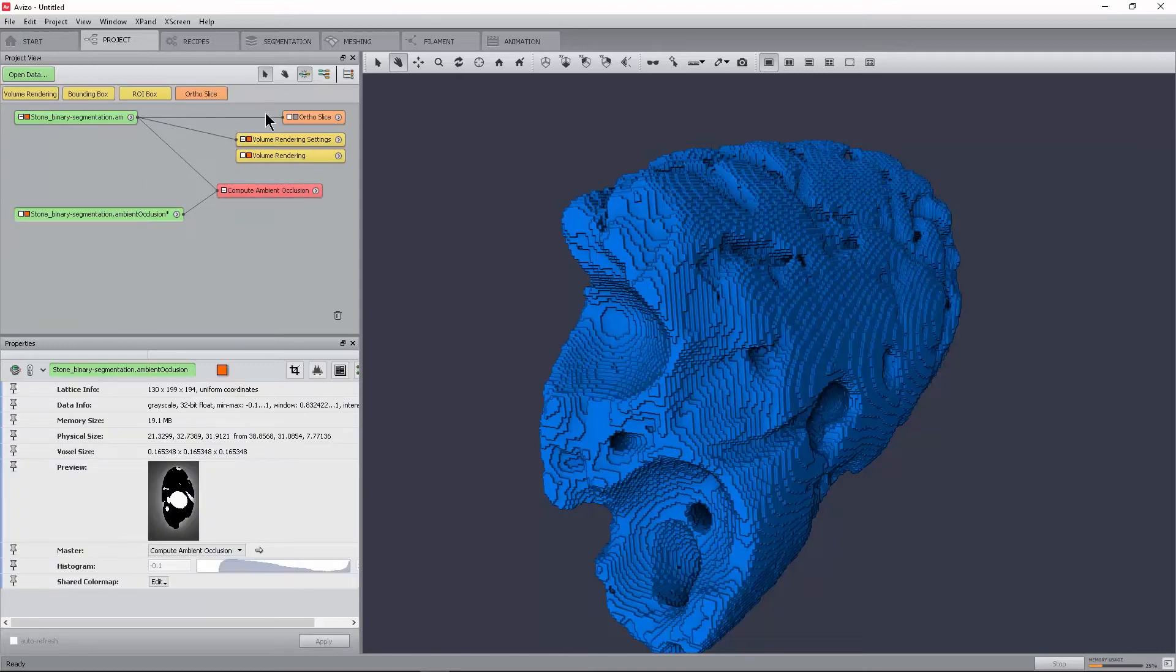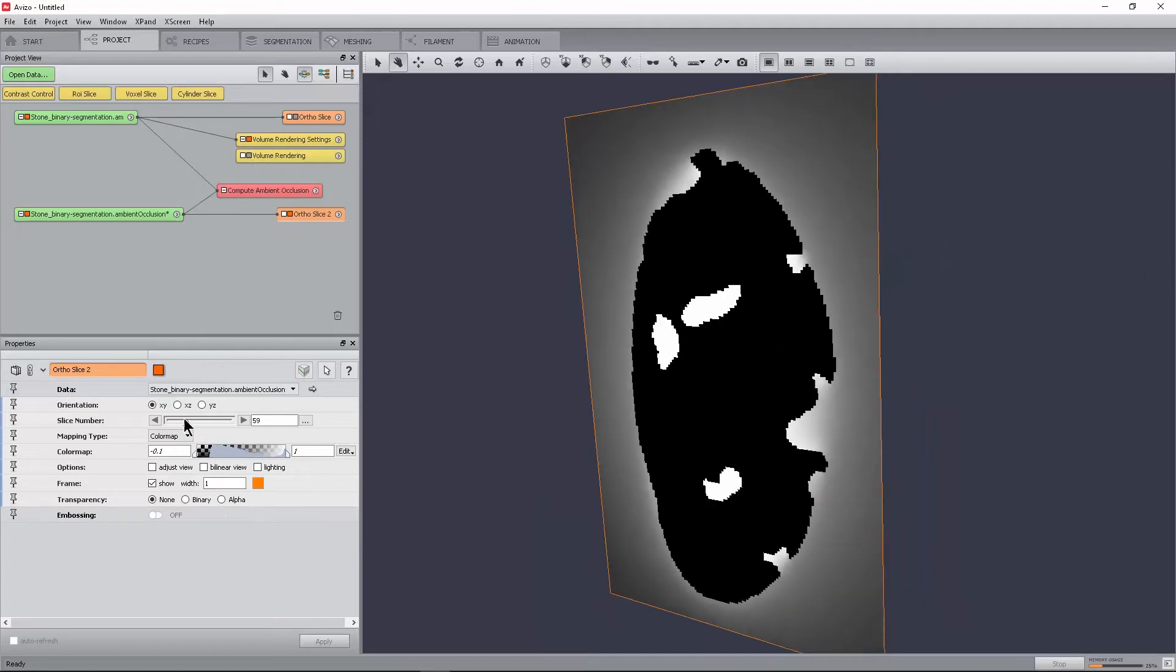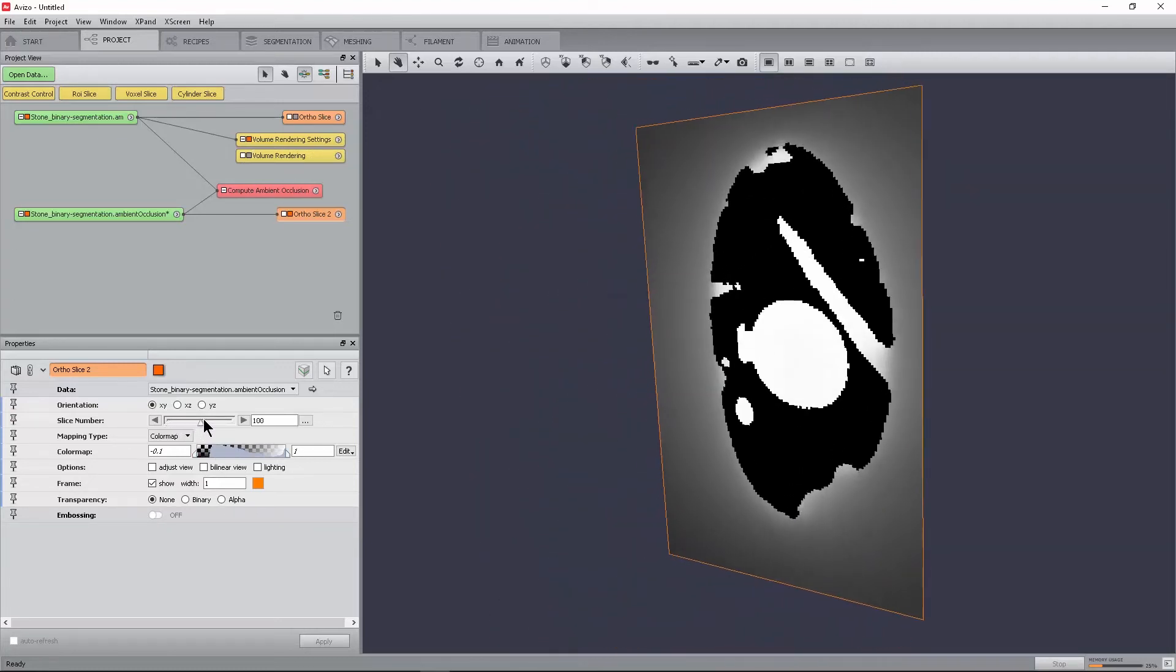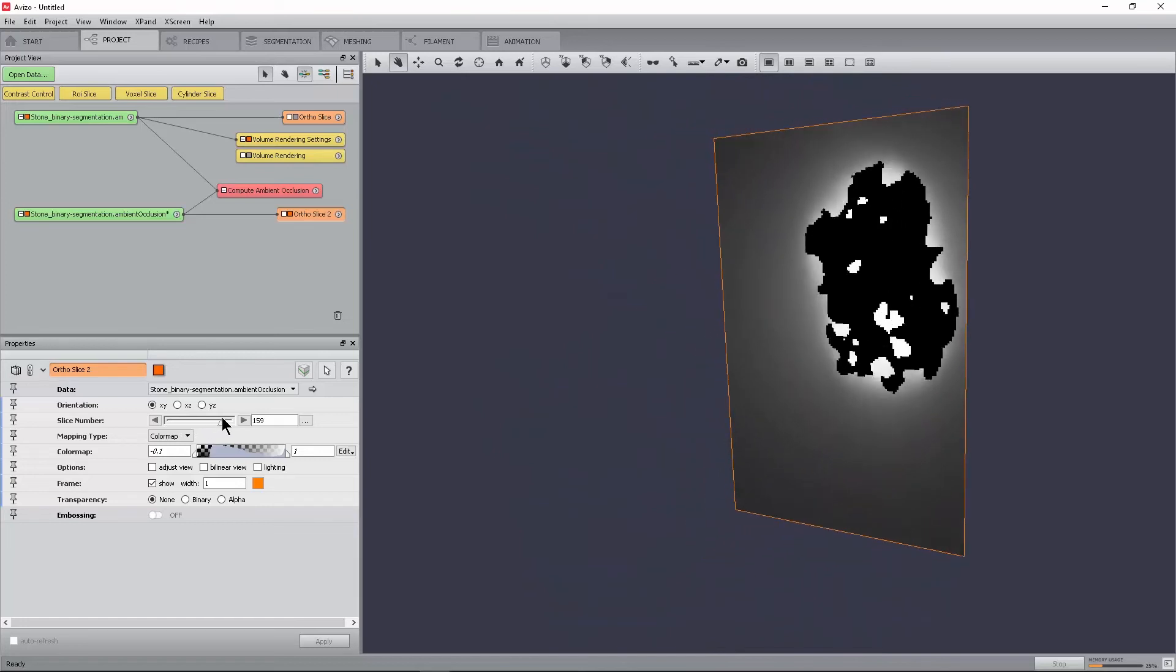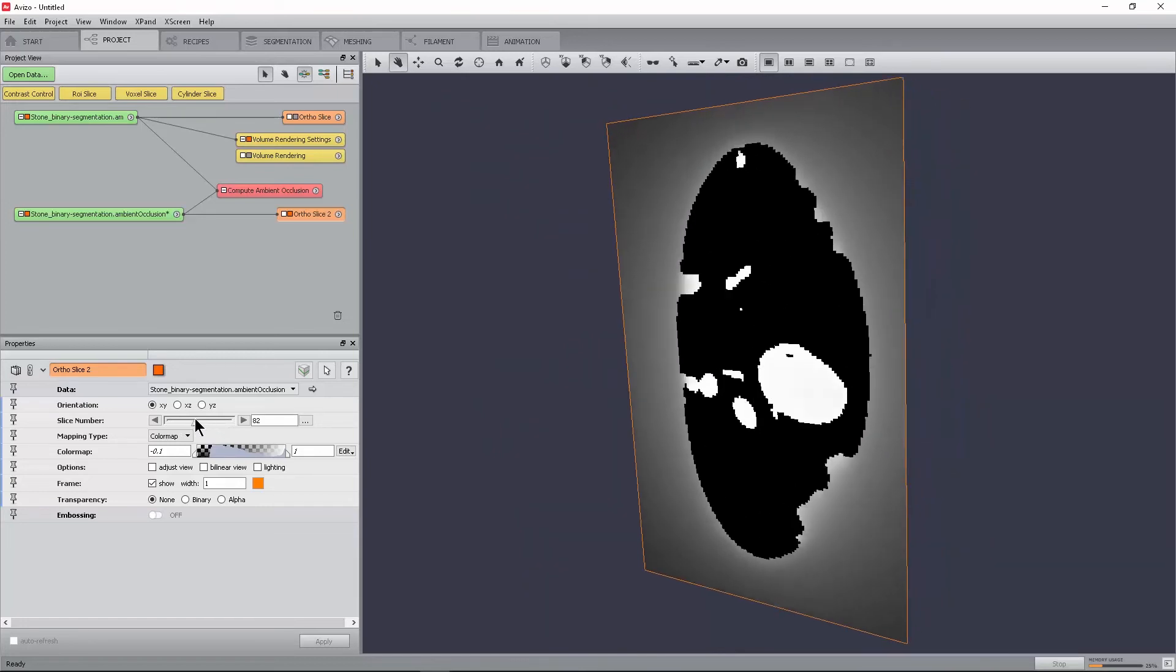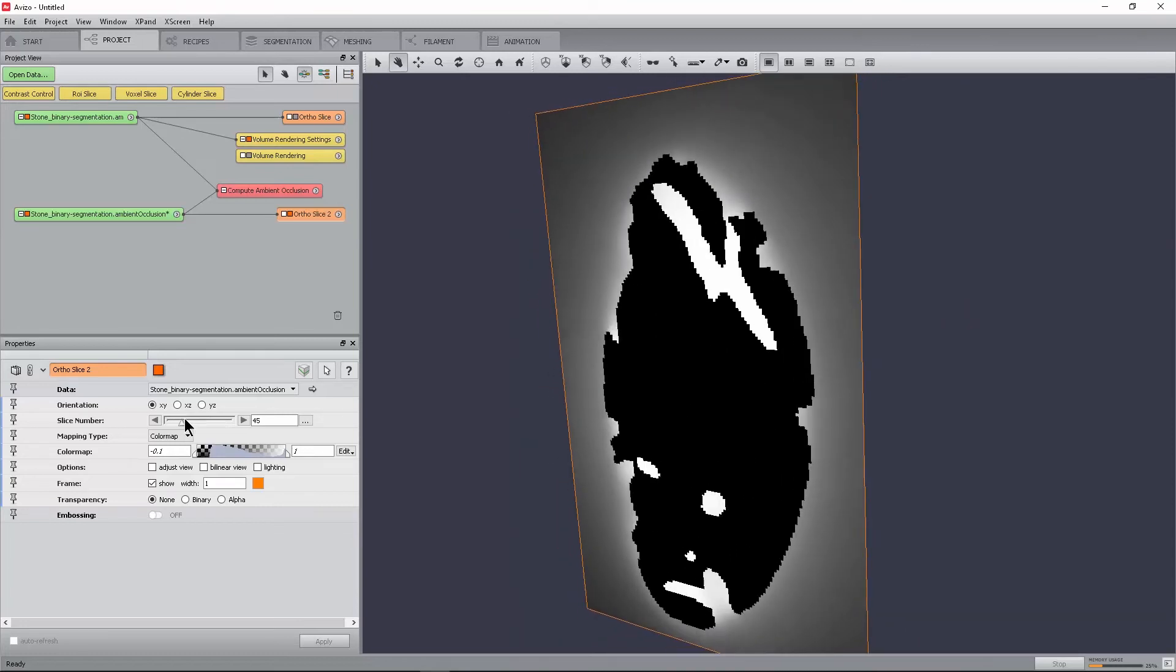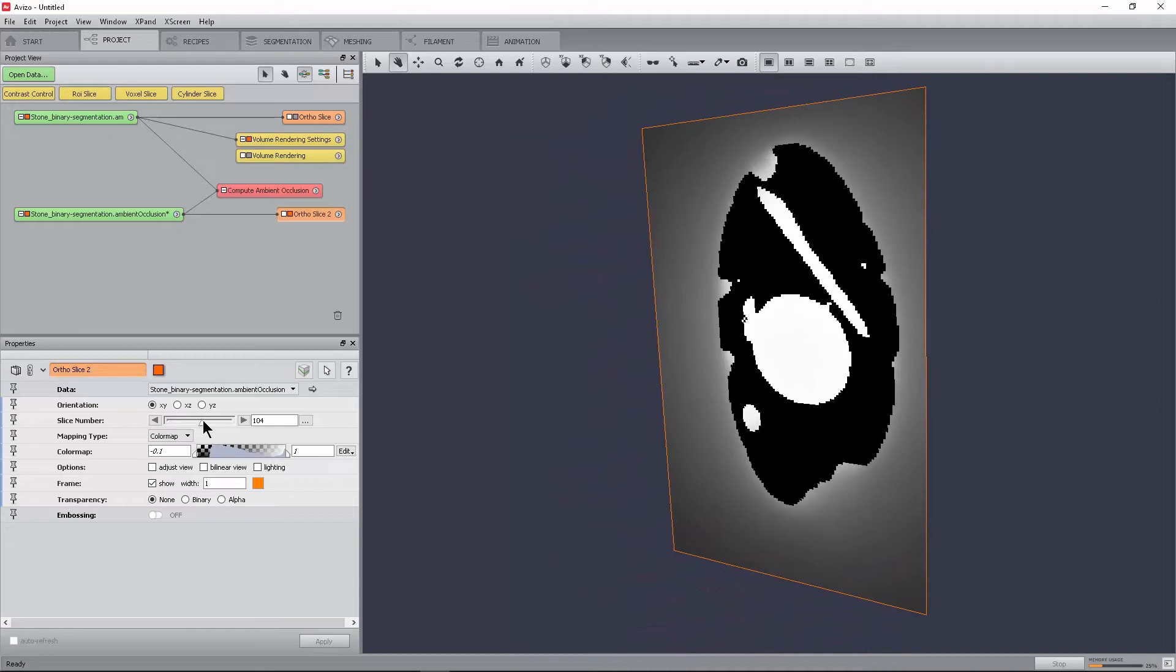As a result of the computation, a new data object has appeared in the object pool named StoneBinarySegmentation.ambientOcclusion. This is a float scalar field containing values between minus 0.1 and 1. Values of minus 0.1 are reserved for the foreground voxels. For background voxels, the values vary between 0 and 1, where a value of 1 means fully occluded and 0 means not occluded at all.